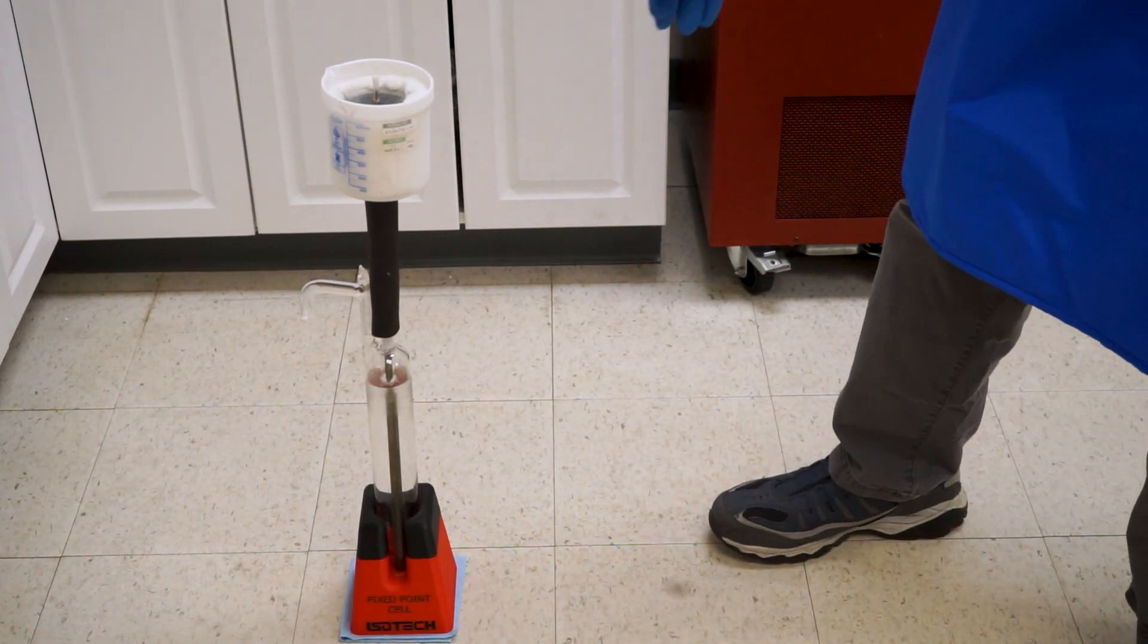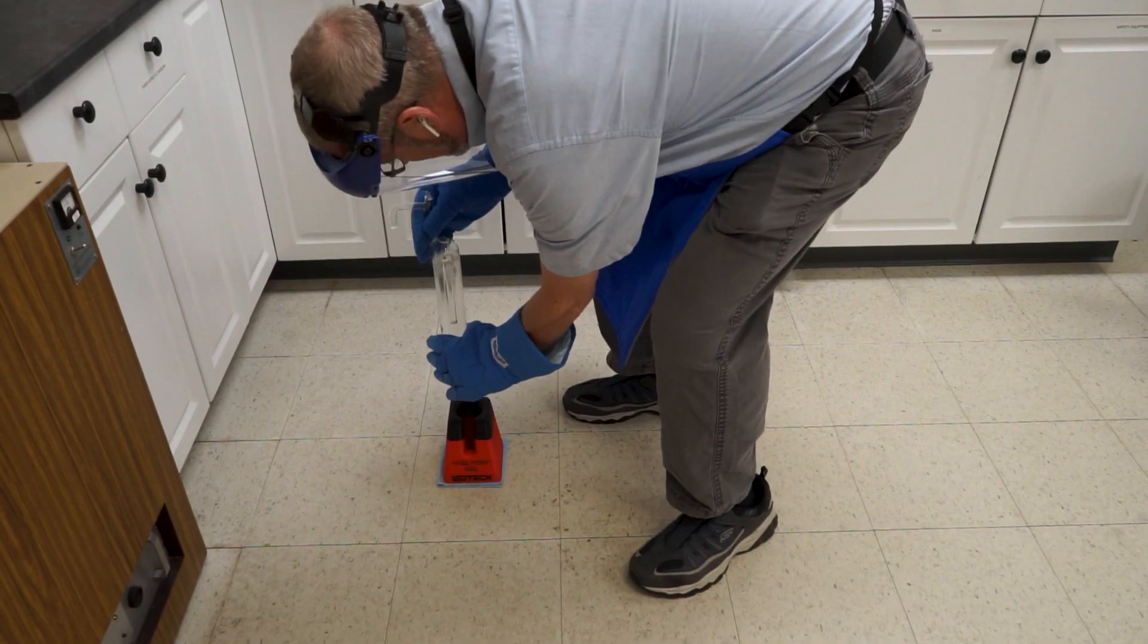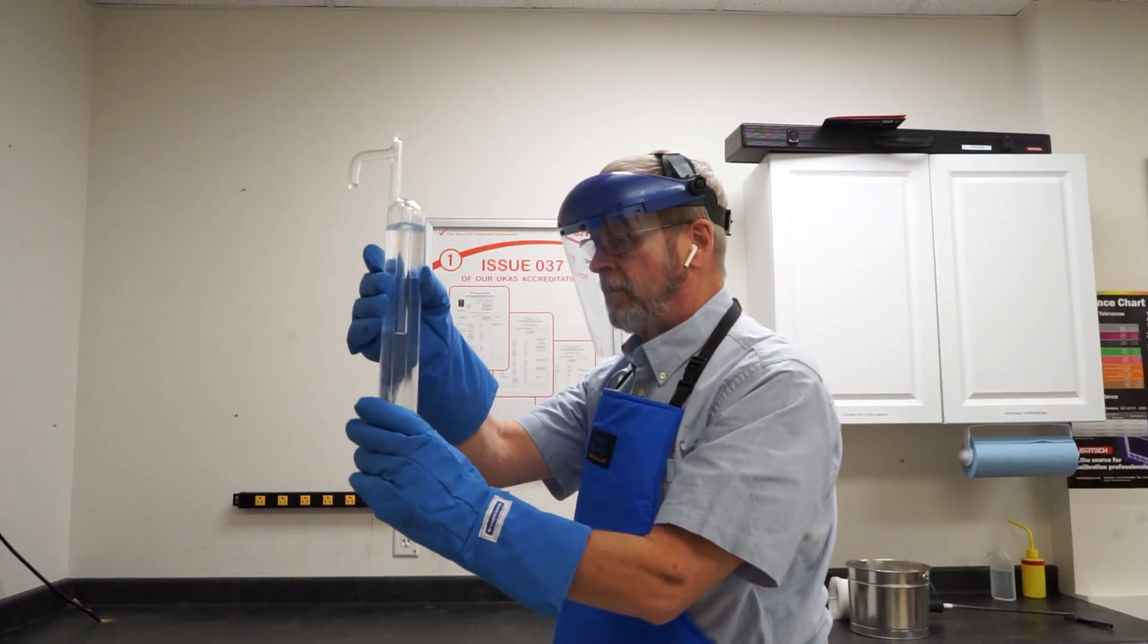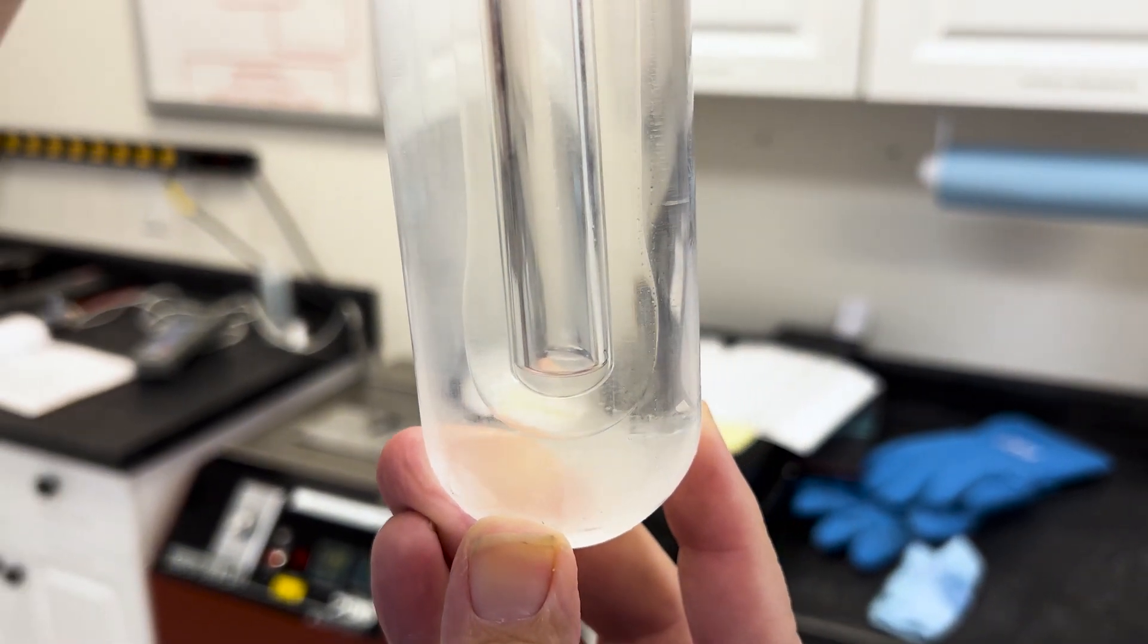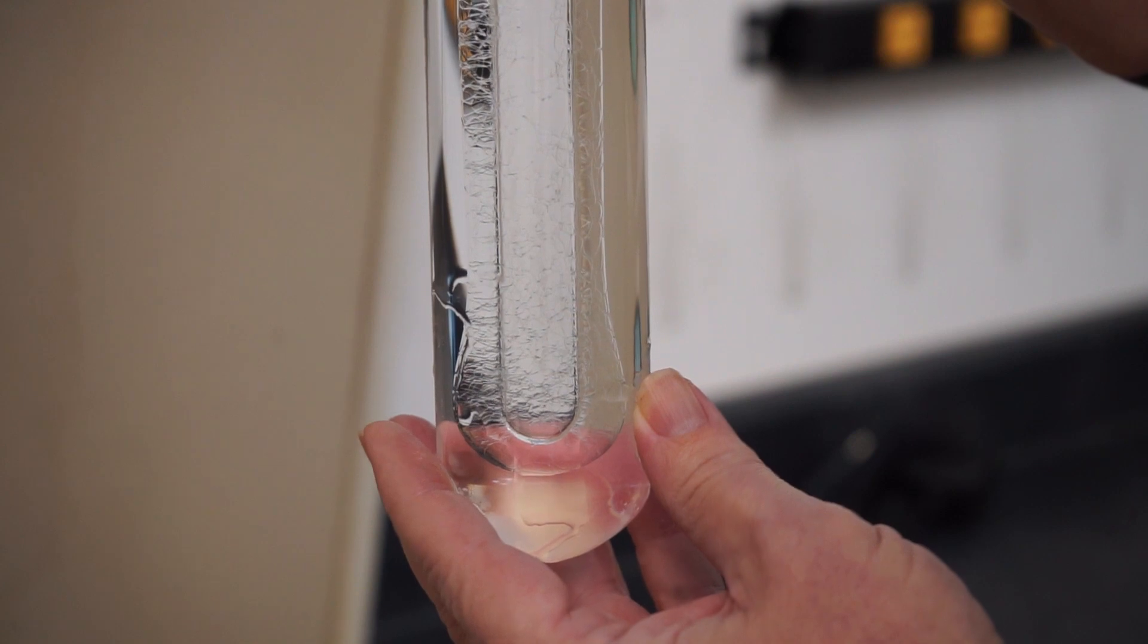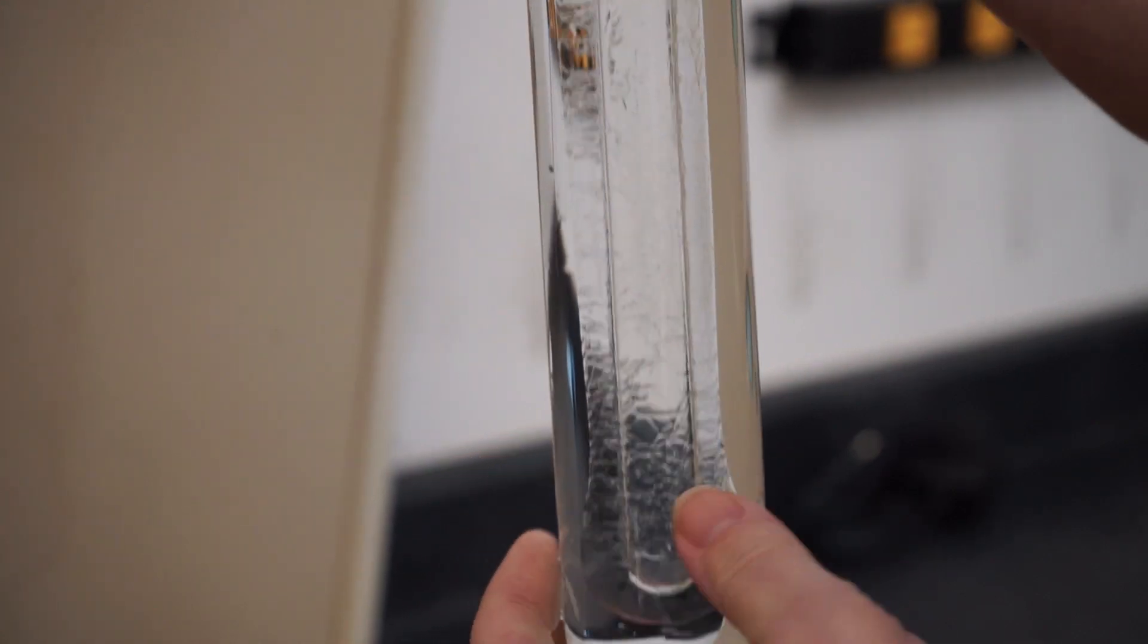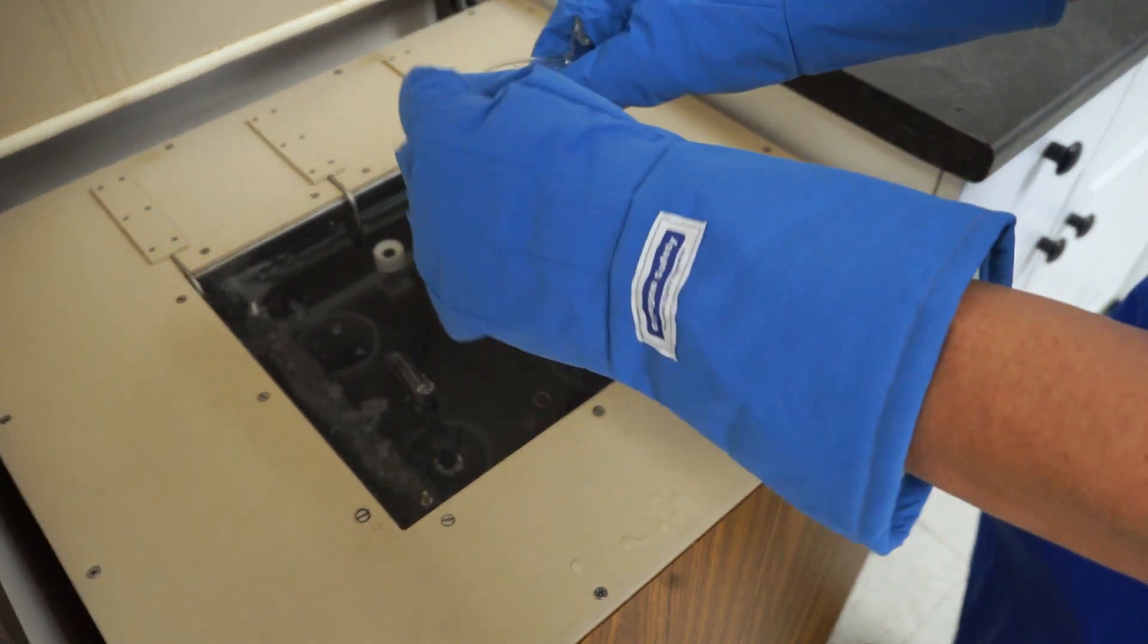Once the triple point of water has successfully been realized, we need to remove the mantle maker from the cell. Then, we can take the cell out of the stand and perform an additional visual inspection. At this point, it will be more than obvious that the ice mantle has formed, but it is important to wait until the ice is oscillating around inside the cell to take a measurement. The final step is to lower the cell into the maintenance bath, and then the process is complete.